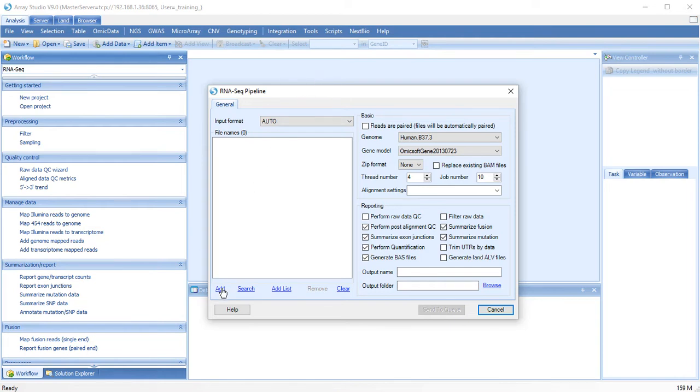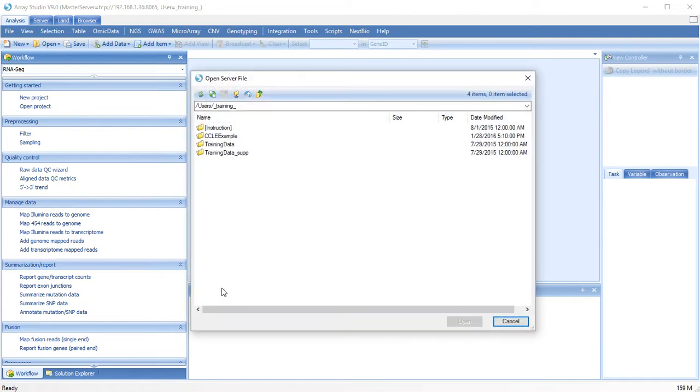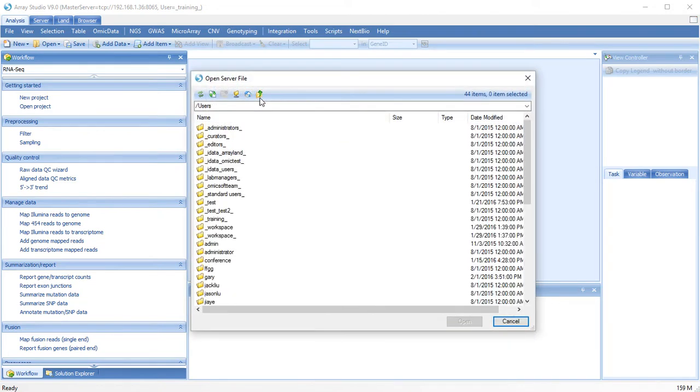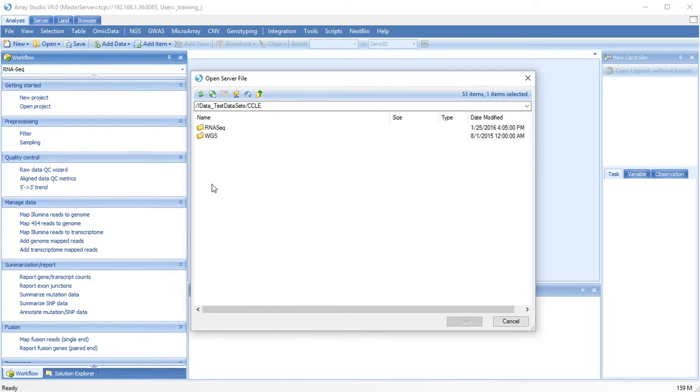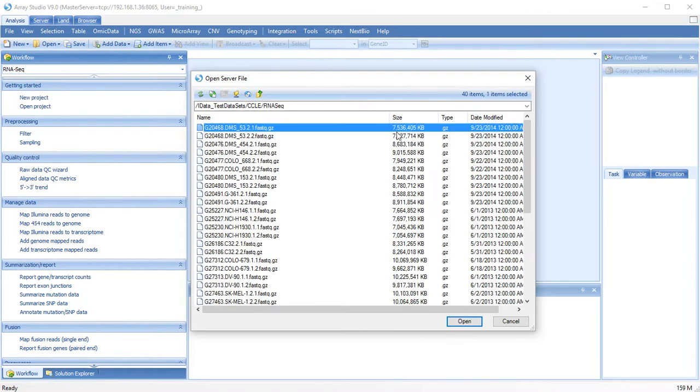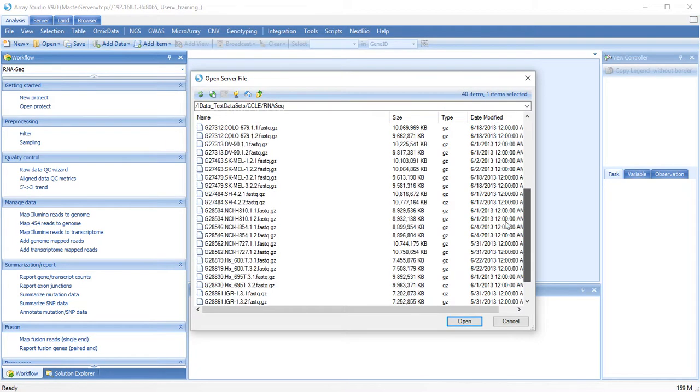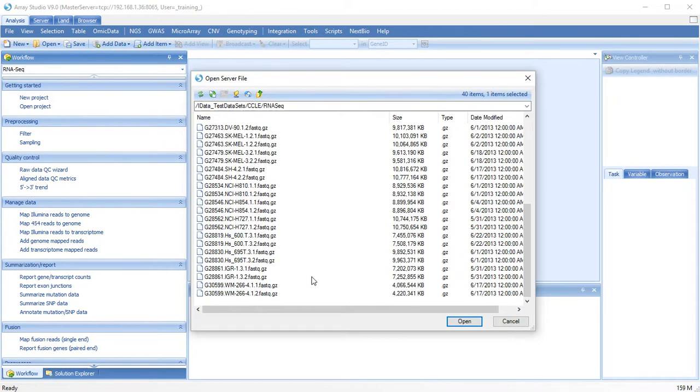To add our reads, click Add, and navigate to your files. In this tutorial, we will use 40 files for 20 samples.